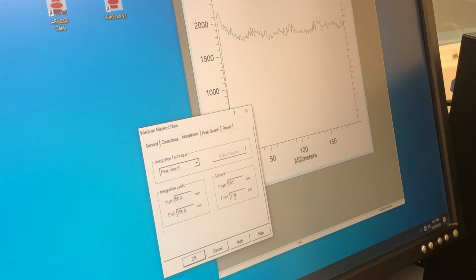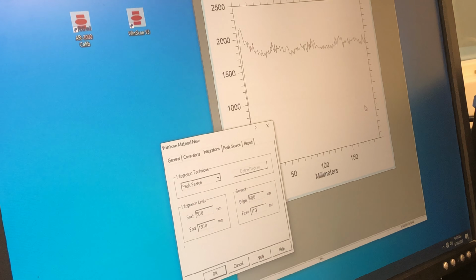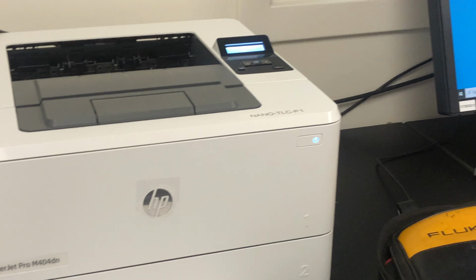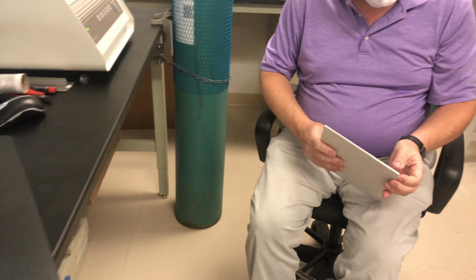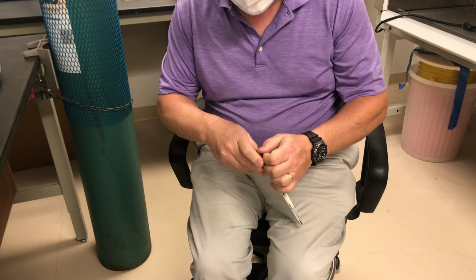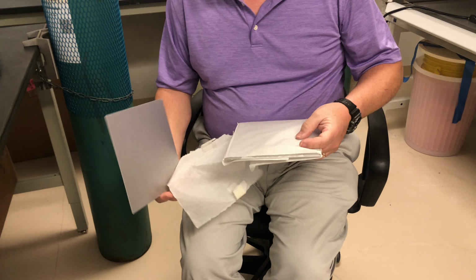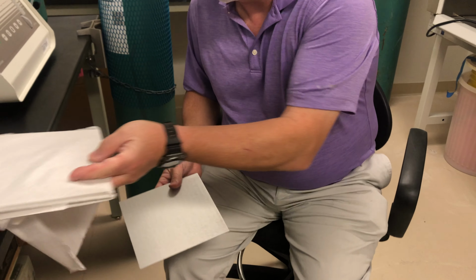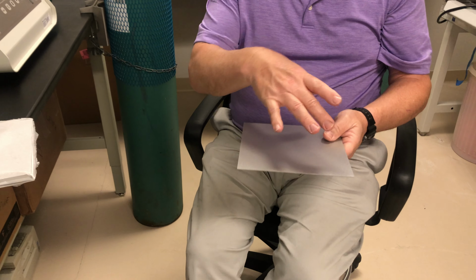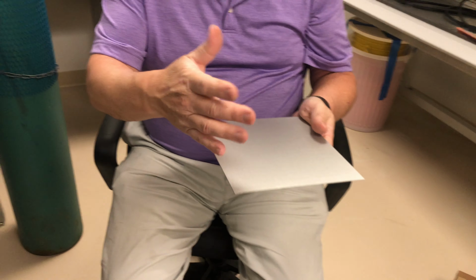So anyway, if you're doing smaller plates, I recommend that you pick a point. These are called carrier plates. This is a carrier plate, and this is what you put your TLC strip on, which is typically plastic or aluminum or glass.